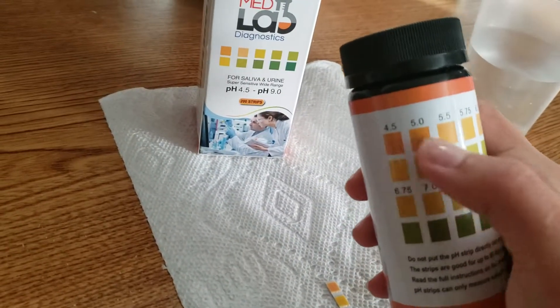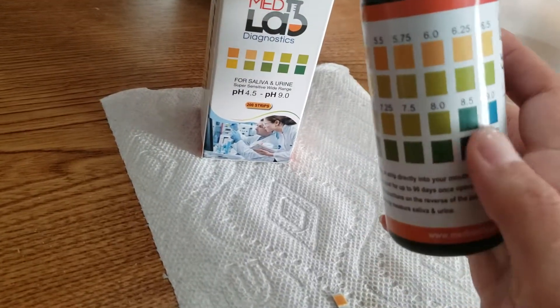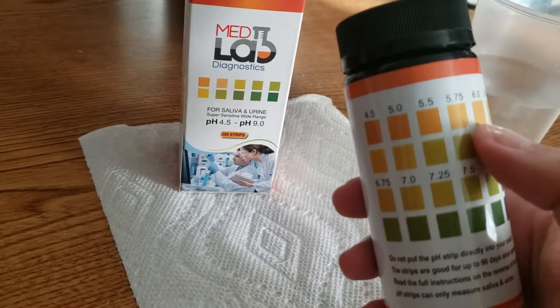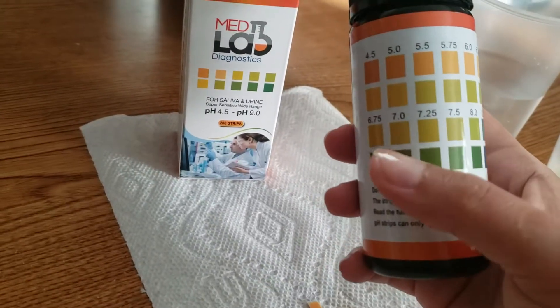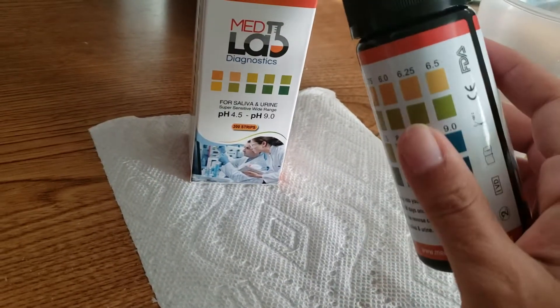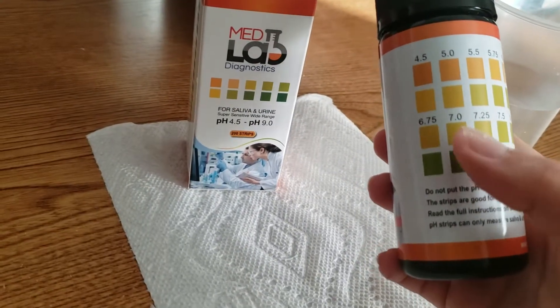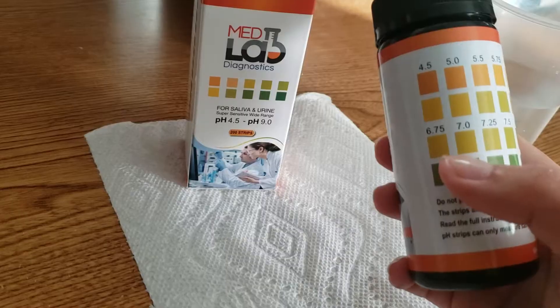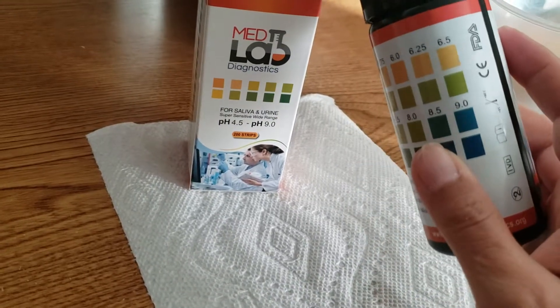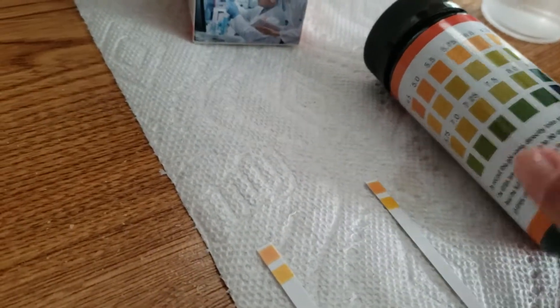This whole set of results up here is one set, and these results down here are a different set. Normally the acidic results are at the top and the alkaline results are at the bottom. Anything between 4.5 and 6.5 is acidic, 6.75 is still a little acidic, 7 is neutral, and anything from 7.25 on to 9 is your alkaline results. Let's go ahead and compare the results now.